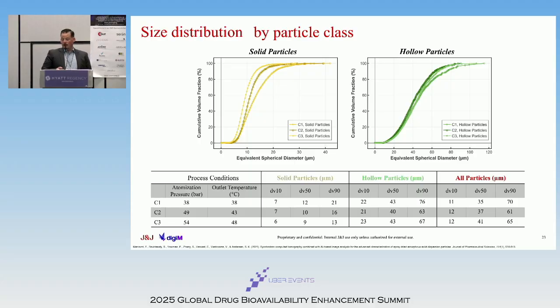We can then go in and do a very robust particle size distribution measurement. So in this table here, the red on the right is actually all of the phases together. So this would be the most similar to laser diffraction. But there's a couple advantages with this image-based approach, where we can visually see where maybe particles are just in close contact or aggregated a little bit, and we can digitally cut them apart. So we're getting a much better true individual particle measurement.